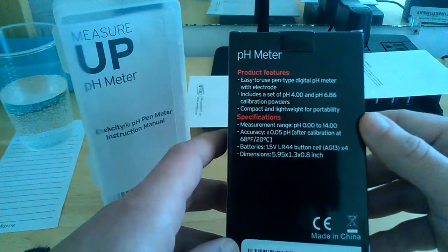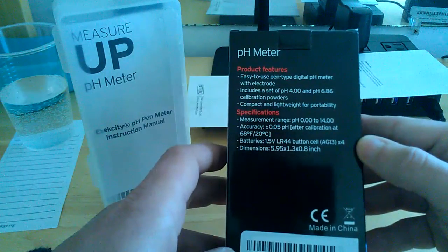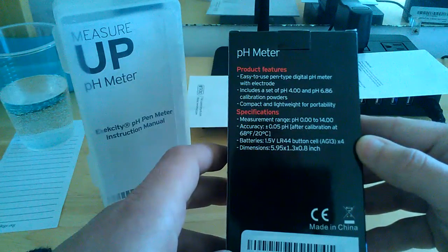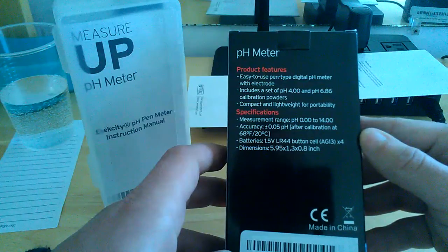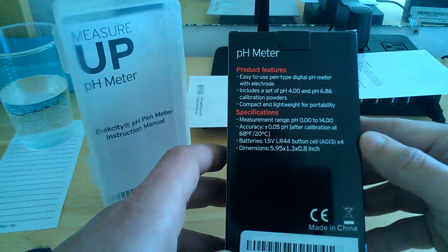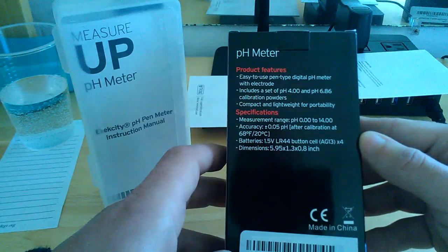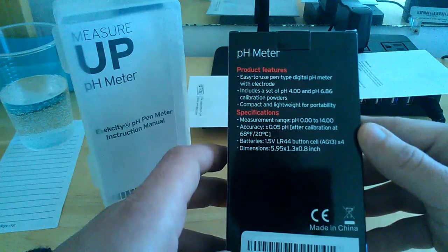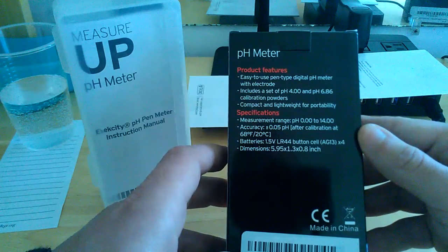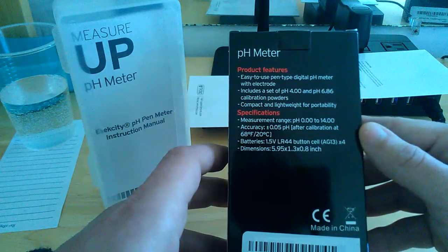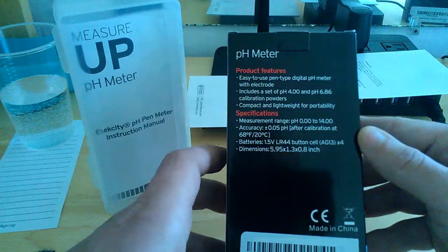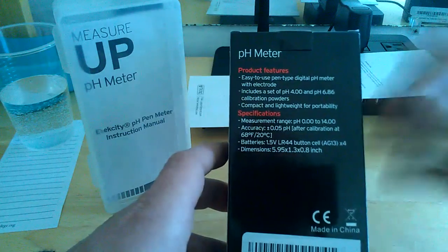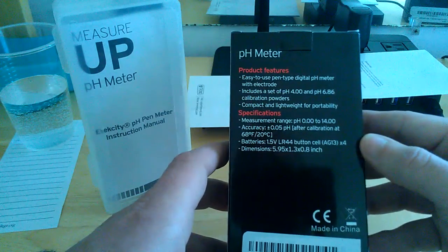It's compact, lightweight for portability. The specifications here, the measurement range is a pH from 0-14. Accuracy is 0.05 pH after calibration at 68 Fahrenheit or 20 degrees Celsius. You use the packet for that and that's where you get your absolute very precise measurement from.